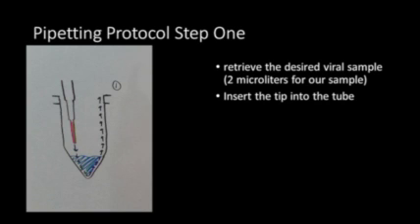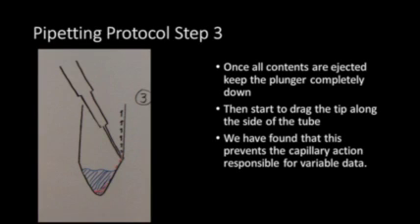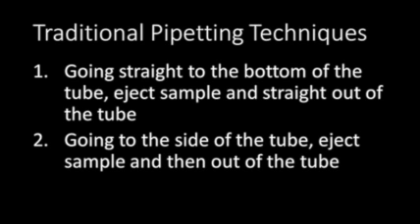So step 1, you just get your sample. Like I said, we use 2 microliters, and you insert the tip into the tube. And once you hit the bottom, you eject all of your sample and immediately start step 3, which is just sliding up the side of the tube. And you do this to help prevent capillary action, because any liquid left in the tube will cause variation in a standard curve. So this just prevents that.